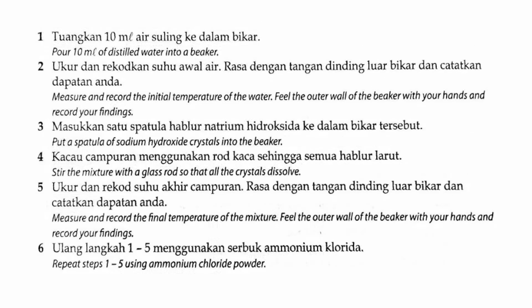Procedure: pour 10 ml of distilled water into a beaker. Measure and record the initial temperature of the water. Feel the outer wall of the beaker with your hands and record your findings. Put a spatula of sodium hydroxide crystals into the beaker.